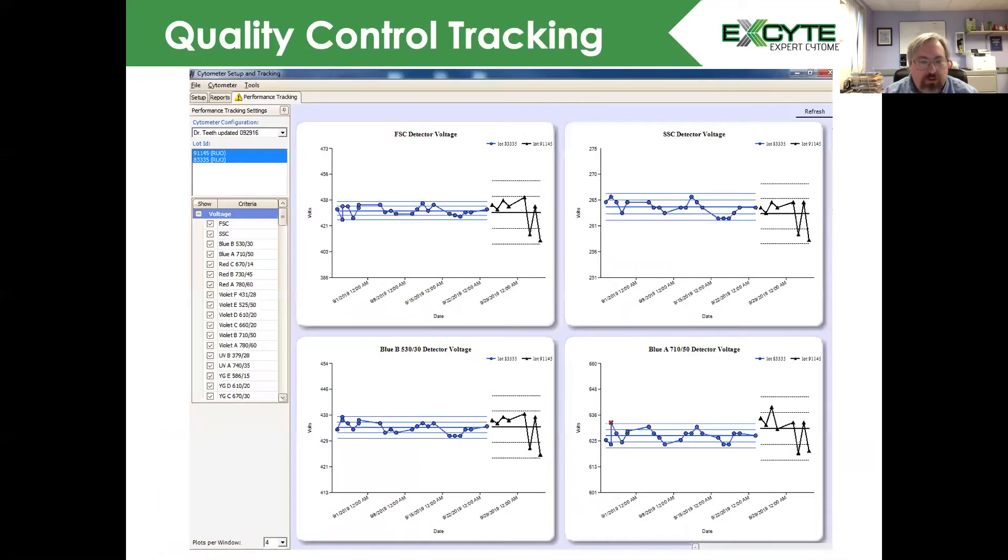An example of a quality control program is here, the CS&T Beads by BD. You can see we're tracking using a Levy Jennings plot, and when there was a change in the bead lot, we saw a different change in the performance of the system. So we would need to characterize that.